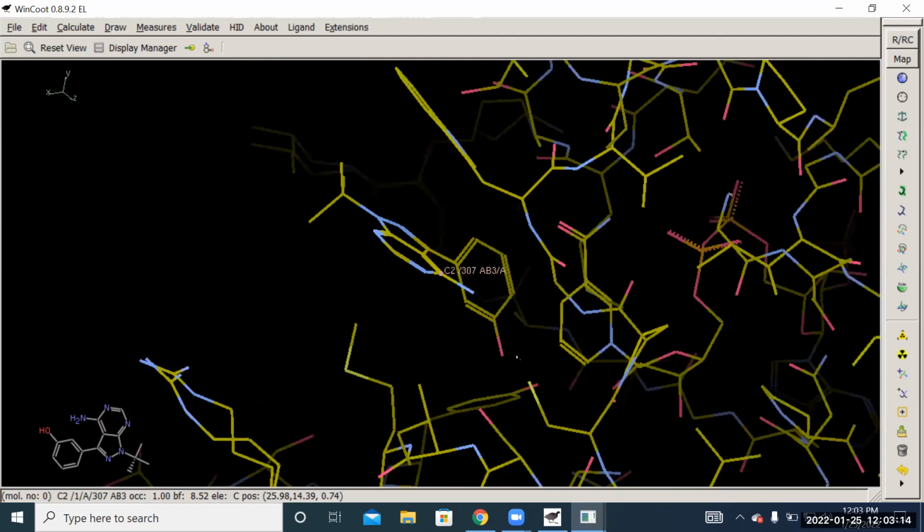So in this inhibitor AB3, it is the inhibitor that was solved. The structure has been solved, and so its position isn't one that was modeled in. What they did was when they created the crystal and collected the data to determine this crystal structure, they also soaked in the inhibitor and it bound. And this is where it binds, which is where we would expect it to bind.